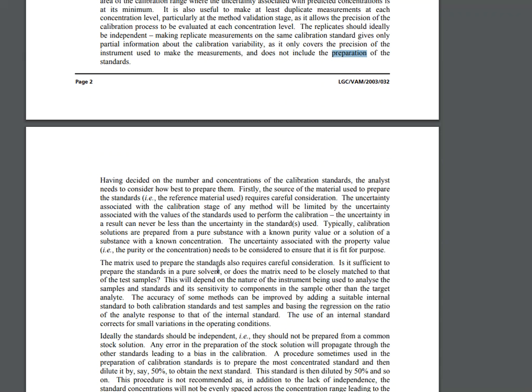The matrix used to prepare the standards requires careful consideration. Is it sufficient to prepare the standards in a pure solvent, or does the matrix need to be closely matched to that of the test samples? And that really depends on what you want to achieve and what you want to accomplish. So we've talked about the problem with the matrix. We've talked about some of the things that we need to watch out for when we choose them, especially when we begin to analyze our blank.